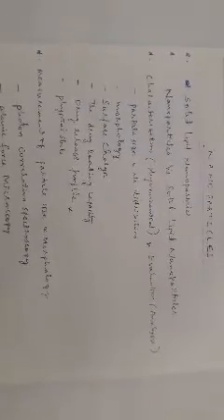Let us start now discussing about the Zeta sizer for evaluation of nanoparticles.